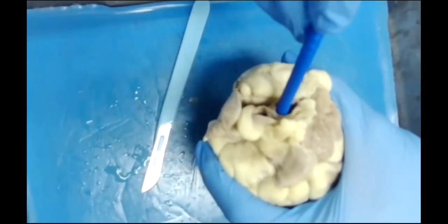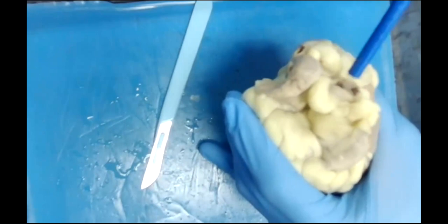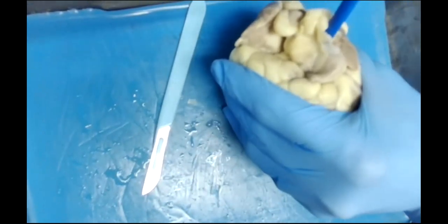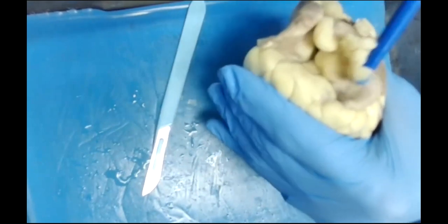Now, one great tool when looking through these is going to be our probes, so that we can see exactly where these vessels are going.